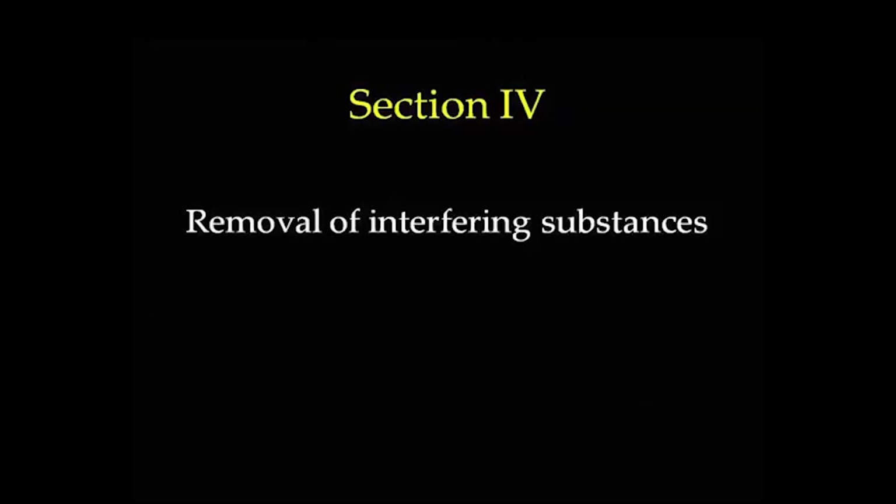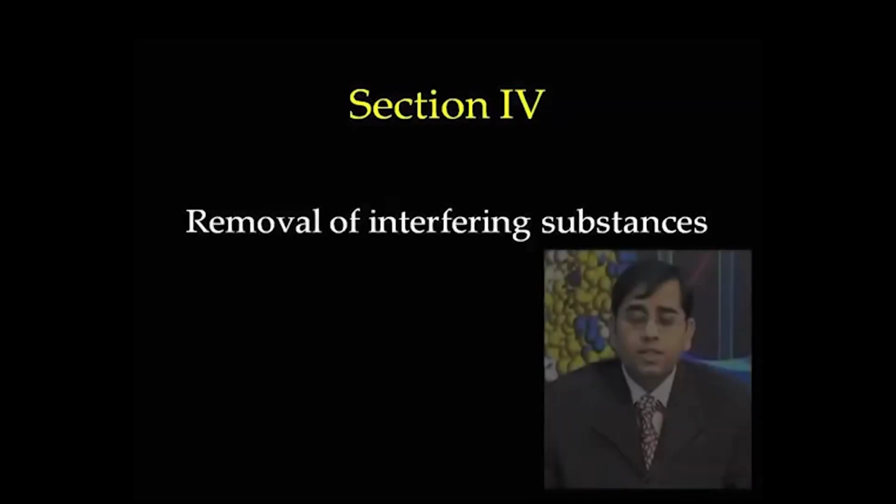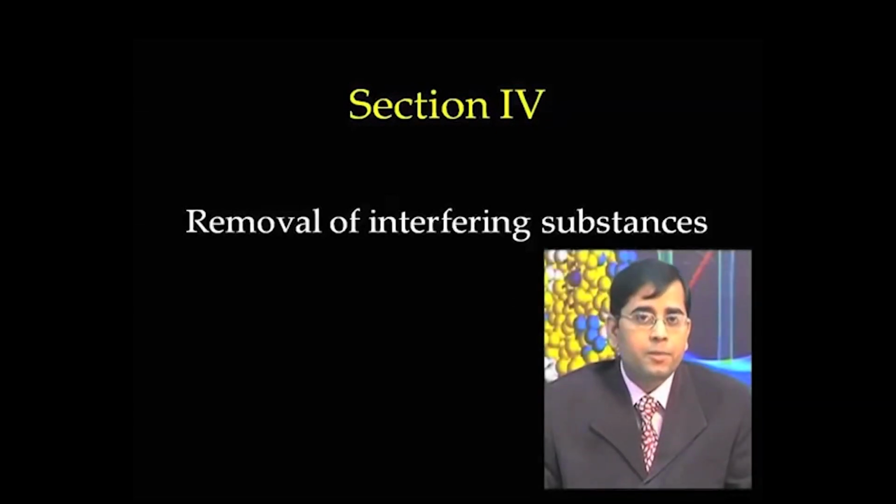Now, let us talk about how to remove the interfering substances, because as I mentioned, the interfering substances are very detrimental for any of your proteomic applications, whether you want to perform 2-dimensional gel electrophoresis, or go for directly LC-MS based applications, or you want to do surface plasmon resonance label free based proteomic techniques, or apply on protein microarrays.